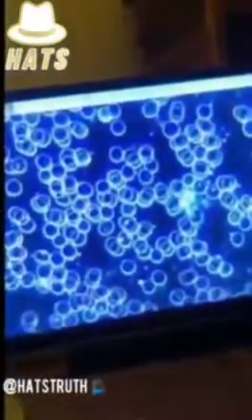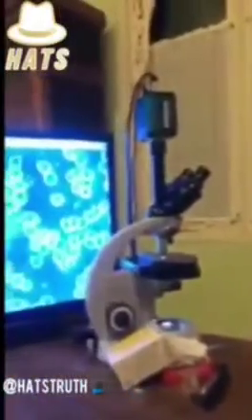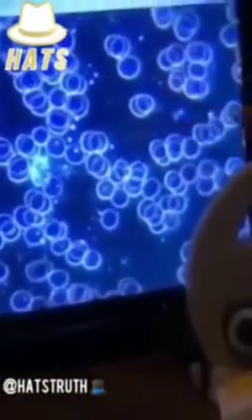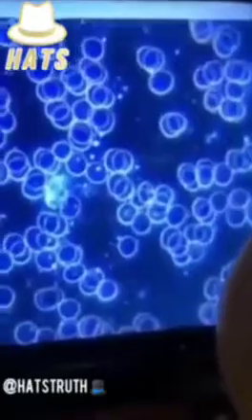All right, so what we can see, we're looking at a live feed of Dr. Peggy's blood, and we can see good quality blood cells. Do you want to add anything before we look at it? No, that's pretty much it. What is also important is that the serum space is clean like here, so there shouldn't be any things that you will see soon in the vaccinated people. We found very strange stuff in his blood, which I haven't seen in 30 years doing microscopy.